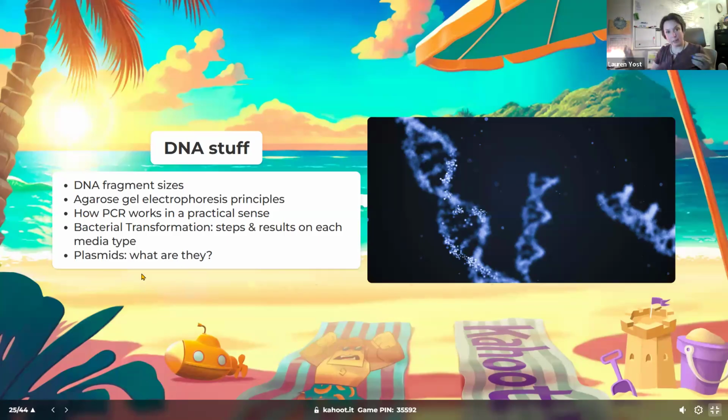Plasmids, what are they? Plasmids, that's what we simulated that we put inside of our E. coli, right? The whole opening it up from the heat, mixing it together with the plasmid gets inside of the cell, and we sealed it in with the cold. That plasmid is a circular bit of DNA. So plasmids are DNA, and so they have genes on them that the cell will read and make the products for the ampicillin resistance, for breaking down arabinose, and for GFP. But the plasmid itself is DNA, and it can be DNA with coding for each of those gene products.